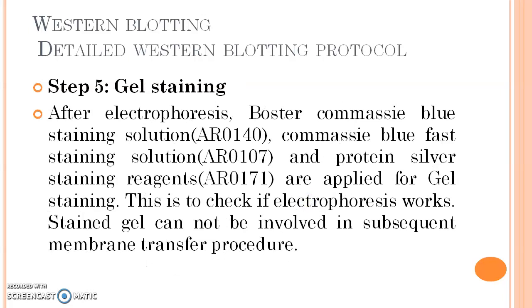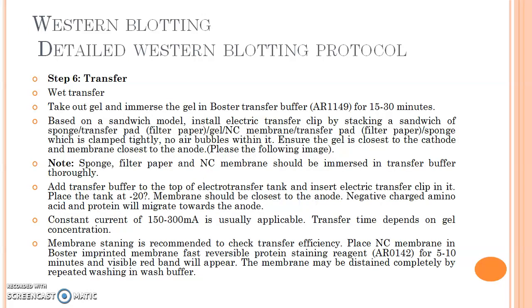Step 5 is gel staining. After electrophoresis, Booster Coomassie blue staining solution, Coomassie blue fast staining solution, and protein silver staining reagents are applied for gel staining. This is to check if electrophoresis works. Stained gel cannot be used in the subsequent membrane transfer procedure.